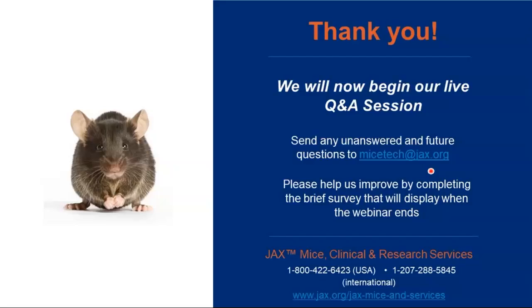You may want to consider looking at how well your mice breed in pairs versus trios to see if there's a difference in their breeding performance. Some facilities won't let you breed in trios, so you can't have as many mice in a cage.